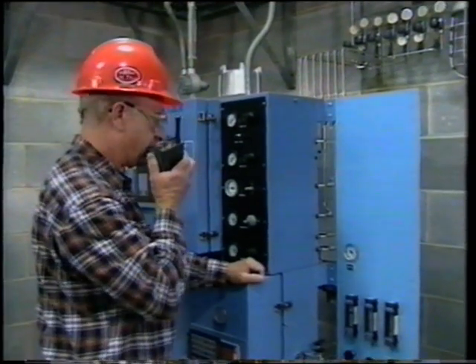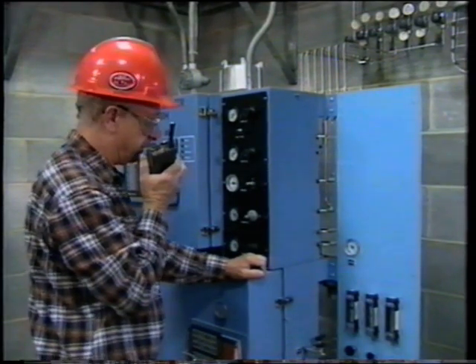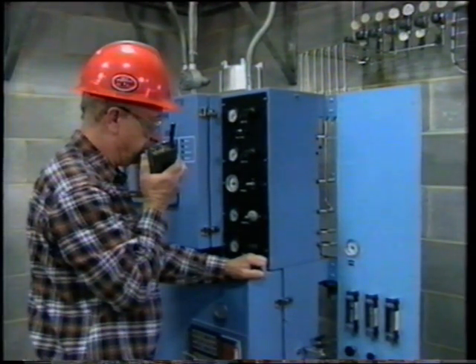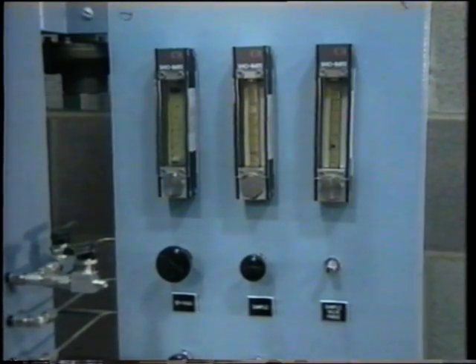Once a problem has been verified, alert control personnel to the time and location of your work. First, check the flow meters to make sure the sample is flowing from the tap through the sampling system. If the flow appears to be normal, the problem may be in the analyzer and not in the sampling system. If there is low or no flow, there may be a leak or blockage within the sampling system.